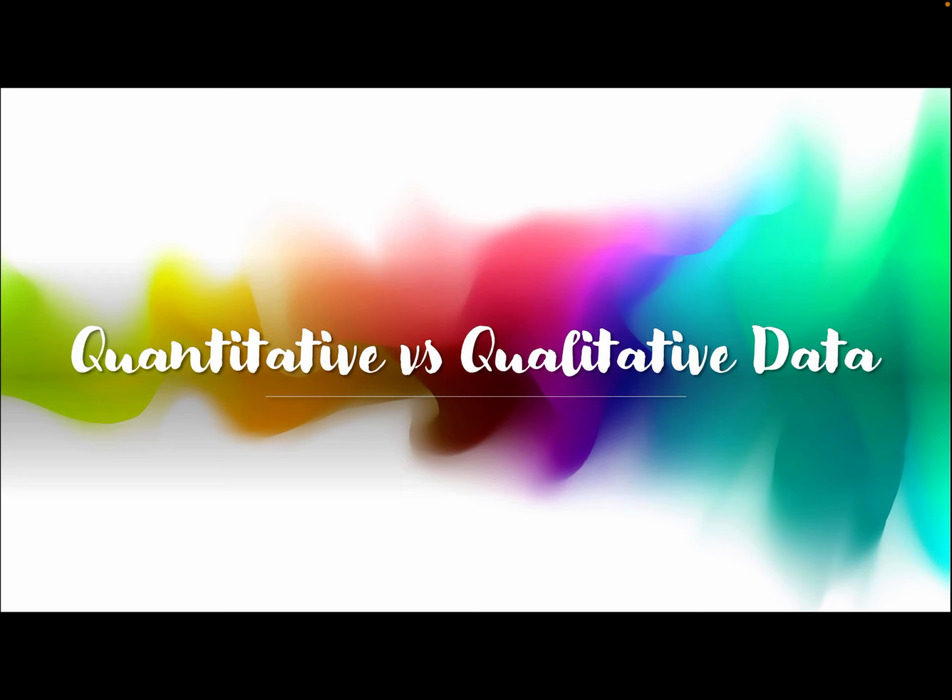So when you do spectrophotometry, you're going to scan across all wavelengths first using a blank to find the maximum absorbance wavelength, which is also the lambda max. And you have to find a wavelength at which all the particles in a solution are visible. And the lambda max is found by finding the highest point along the spectrum's y-axis.